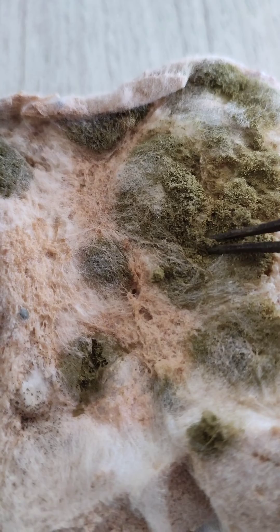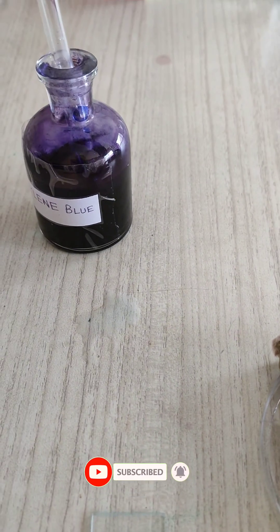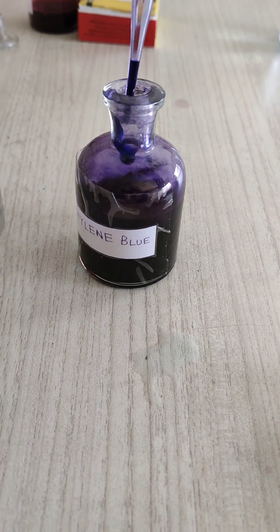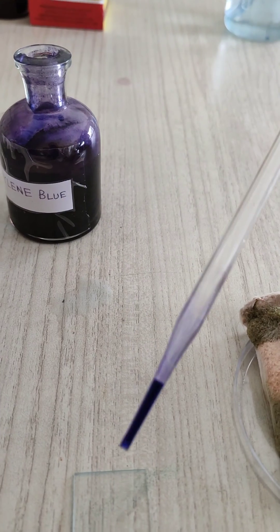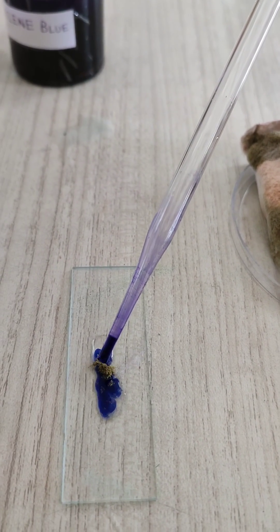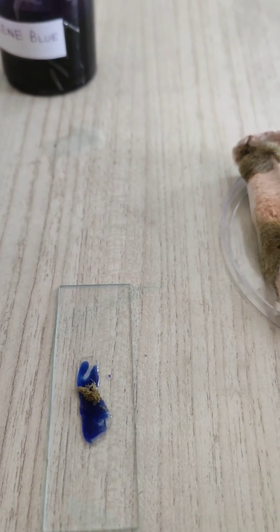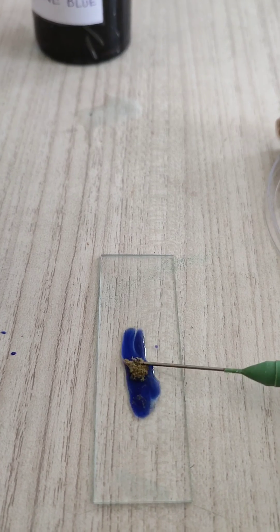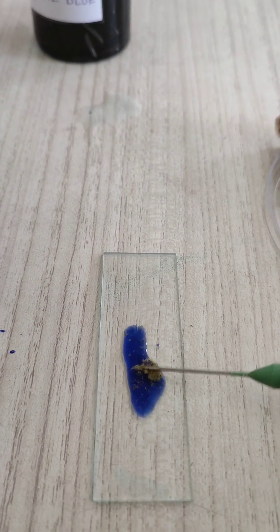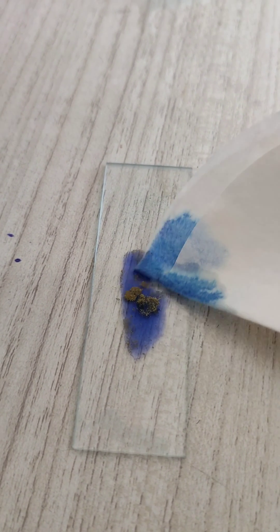First, take a small amount of the fungus or bread mould and put it on the slide. Then add 1 to 2 drops of methylene blue solution for staining, and wait for 2 to 3 minutes. After 2 to 3 minutes, remove the excess stain using the help of filter paper.